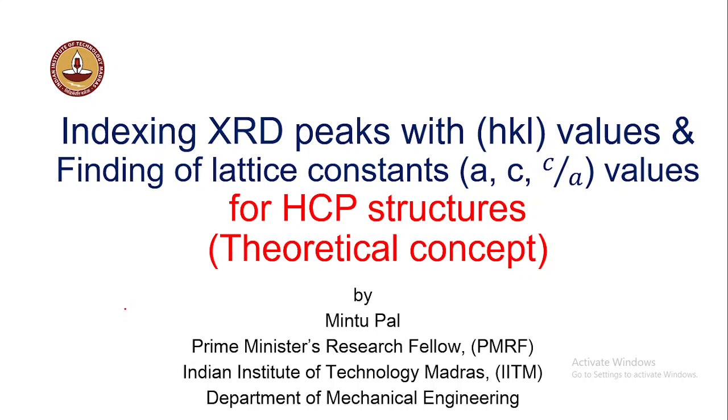So today in this video I'm going to discuss a very important topic, how we can index the XRD peaks and how to find the lattice constant values like a, c, or the c by a ratio for the HCP crystal structures.